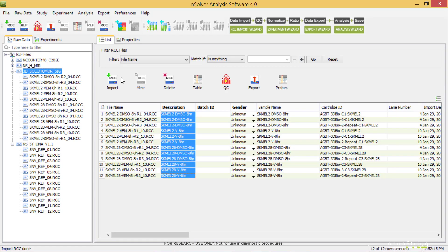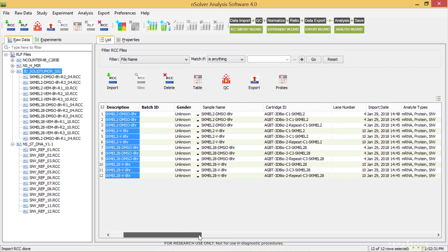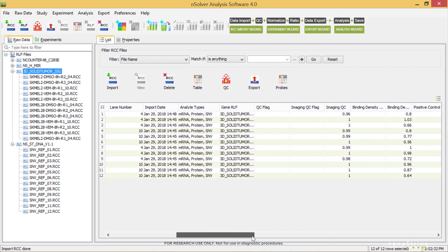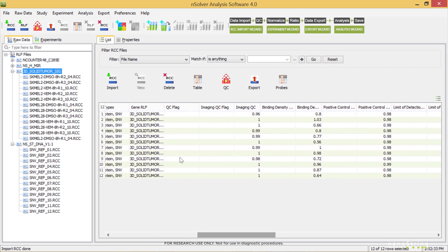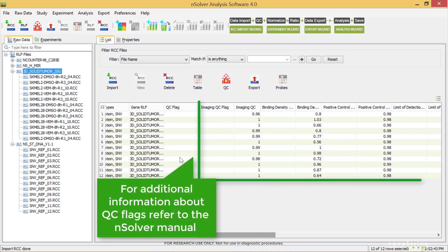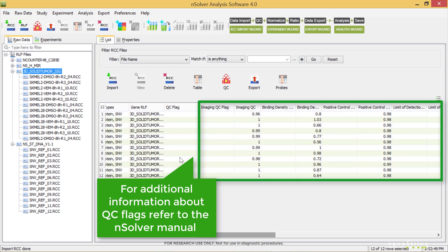As we scroll to the right in this table, we notice that the first QC column is labeled simply QC Flag. A flag in this column indicates that there is a QC flag of some sort associated with this sample. Farther to the right, we'll be able to see the specific QC columns, and we'll be able to start to investigate any flagged samples.